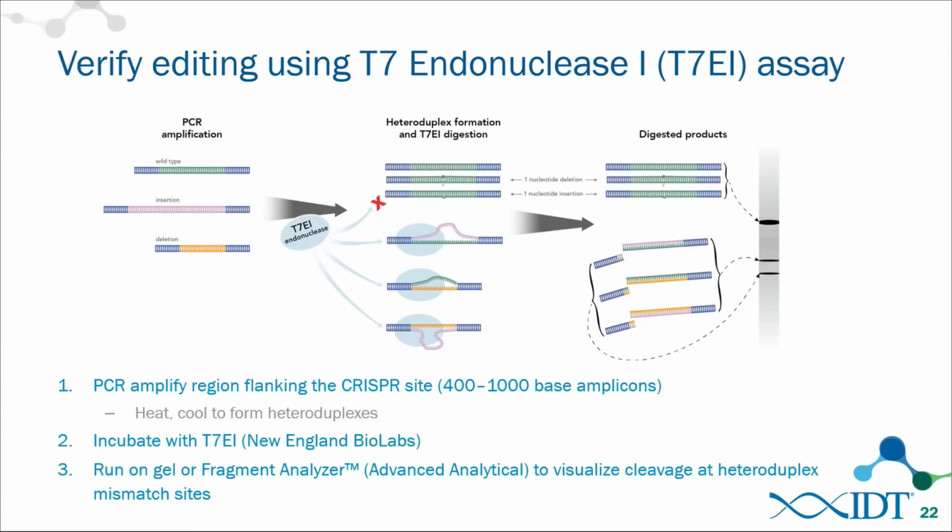The steps for this, of course, are to, as we mentioned, define a PCR amplicon, and we get these amplicons that contain either a wild-type sequence, if there was no double-stranded break that occurred in that particular cell or that particular locus, or if non-homologous end joining corrected the sequence to wild-type. We could have the presence of some wild-type there in our PCR amplification. Other possibilities following the double-stranded break when non-homologous end joining pathways take over are for insertions as well as deletions.